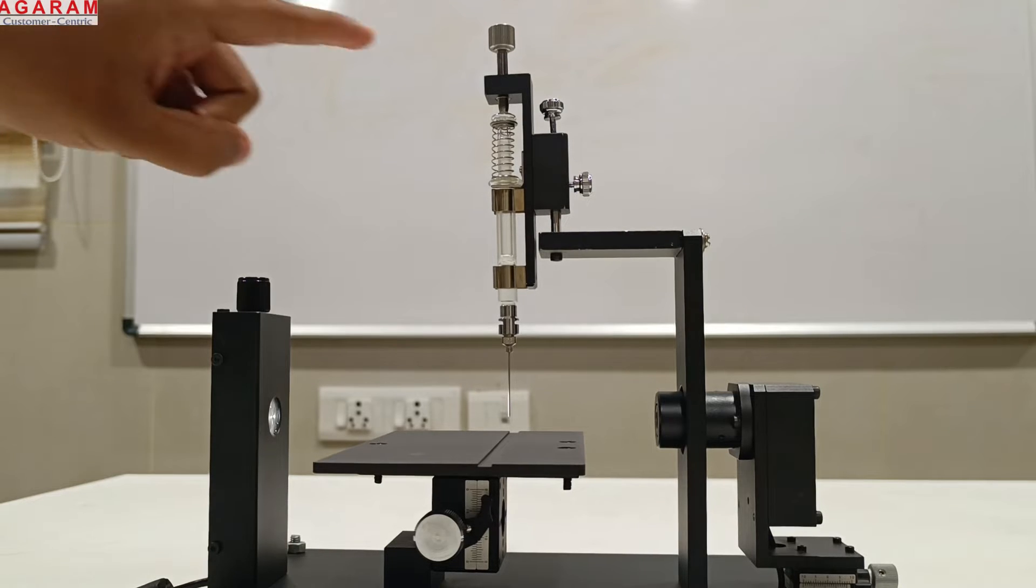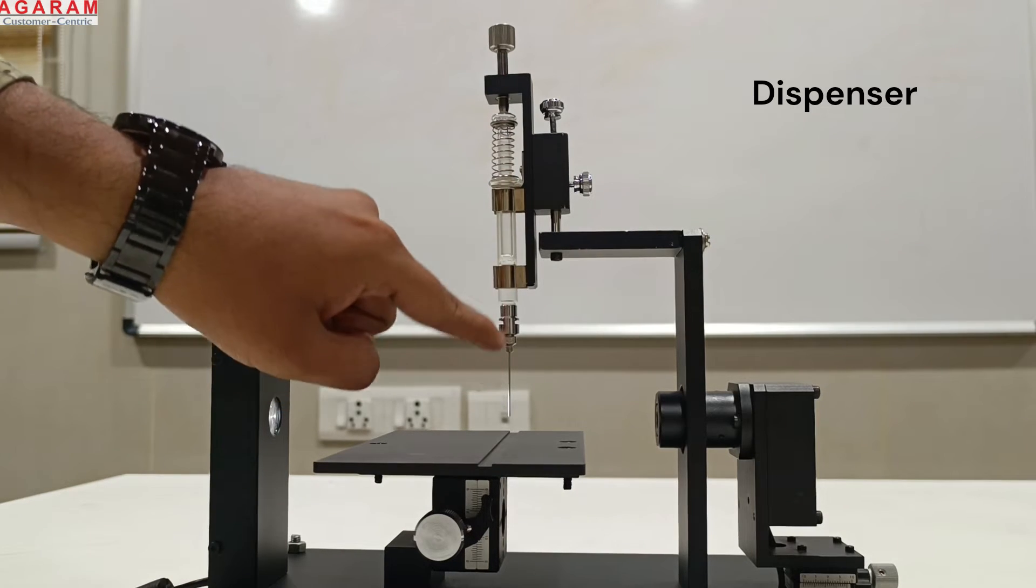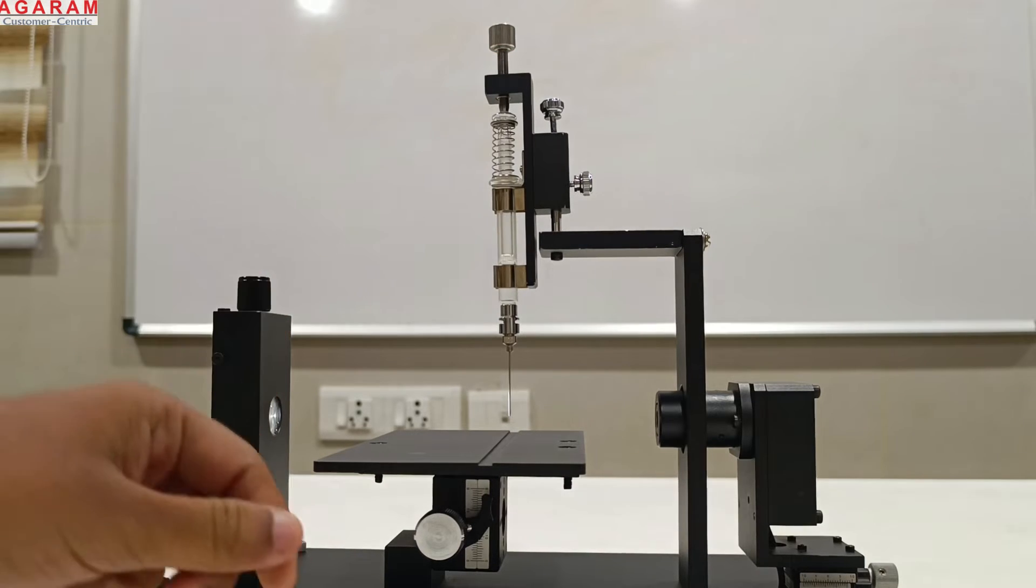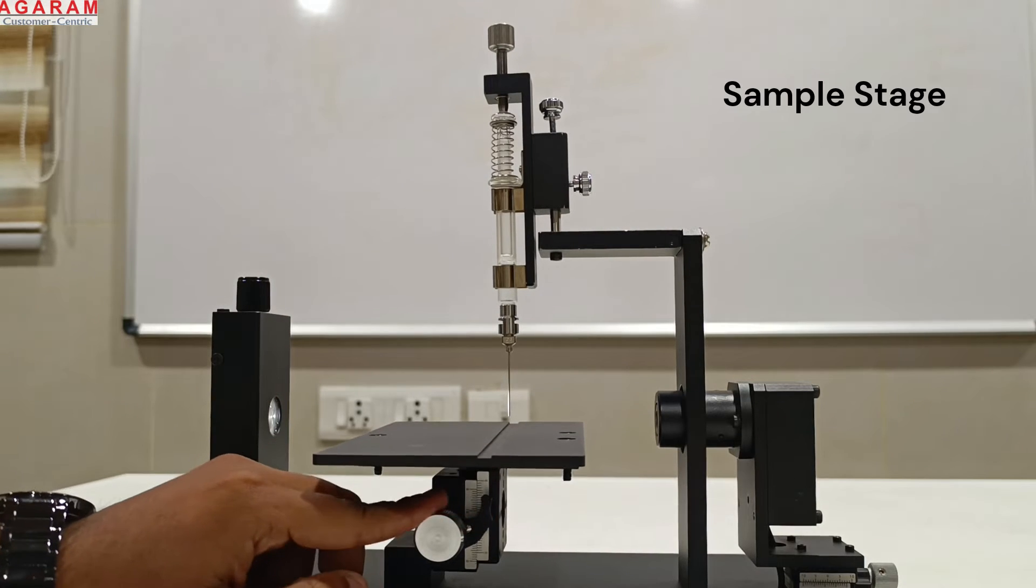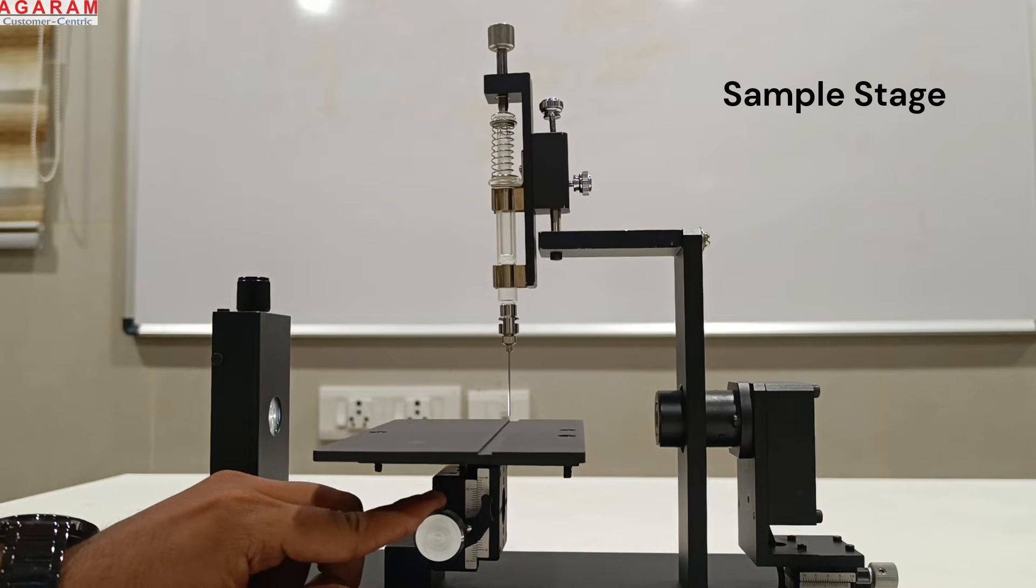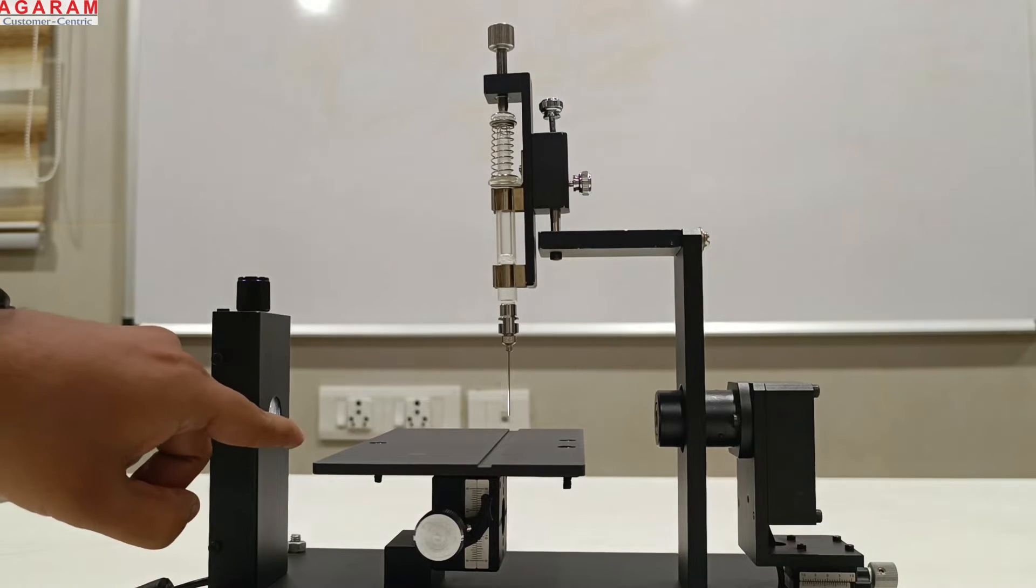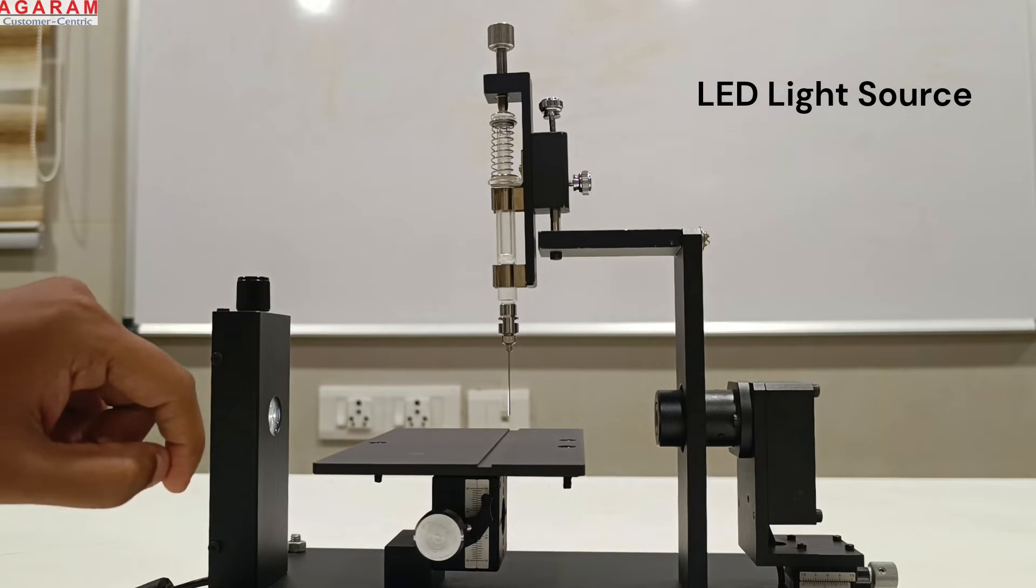The key components in this device are a liquid dispenser with needle, a sample stage that can move in z-axis, high-speed camera to capture the droplet behavior, and LED light for camera background.